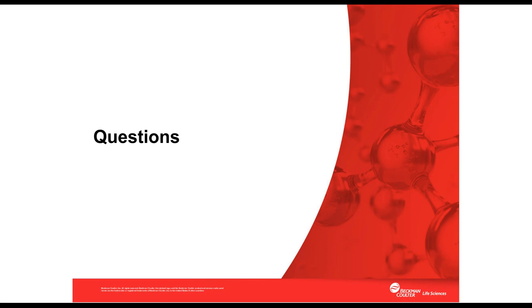Thank you very much for that question. It's a good question. So, as we said, the HIAC remains the compendial pass-fail test. This is the one that you're using for batch release testing, and it's used for product release in USP, EP, and JP.